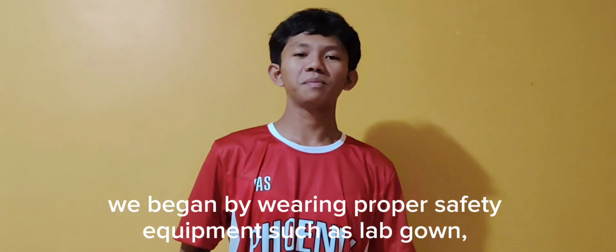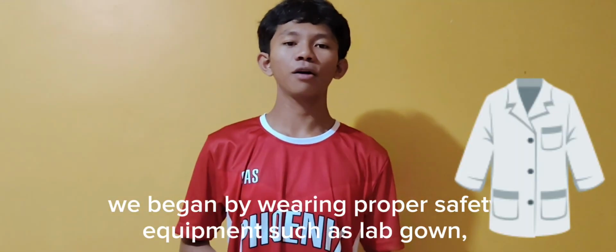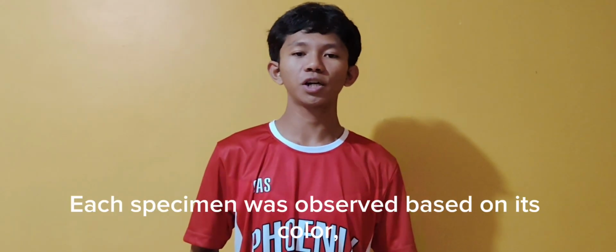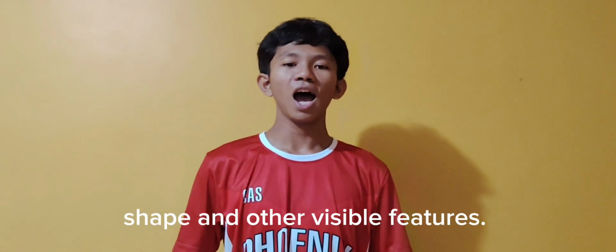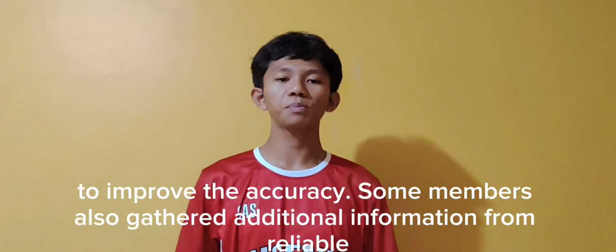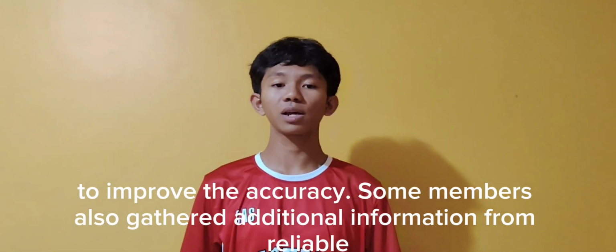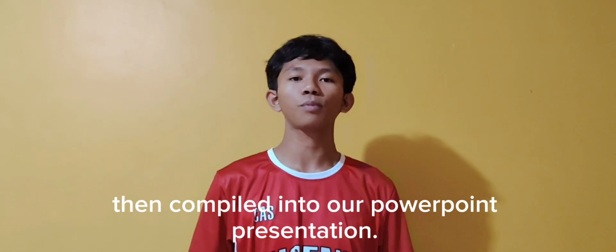In methodology, we began by wearing proper safety equipment such as lab gown, hairnet, face mask, and gloves. Each specimen was observed based on its color, shape, and other visible features. After viewing, our group discussed the results and assigned specimens to each member for detailed descriptions to improve the accuracy. Some members also gathered additional information from reliable online sources, and all of the findings were then compiled into our PowerPoint presentation.